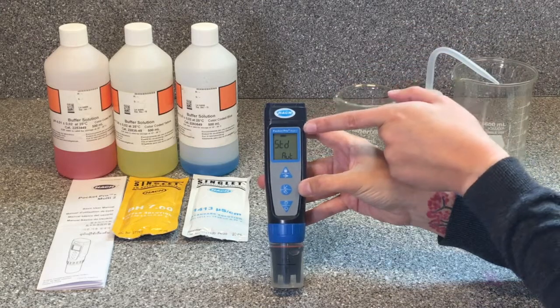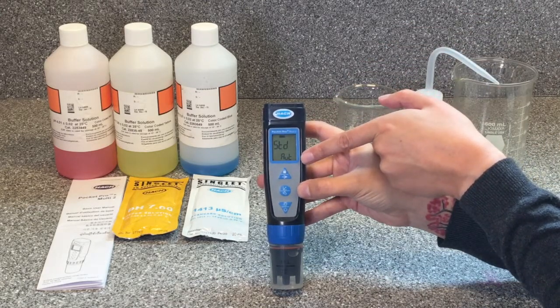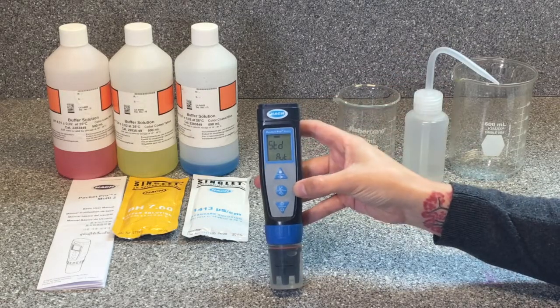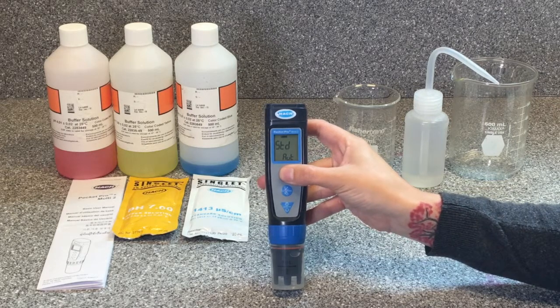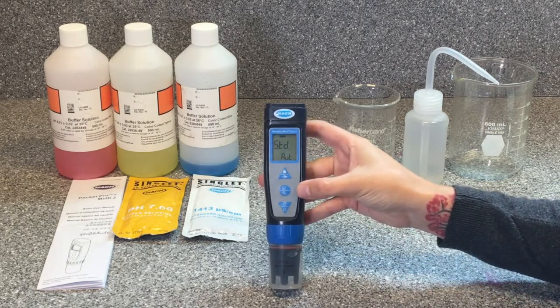The next one should say 'conductivity standard.' We need to make sure it says 'AUT' on the bottom for auto, so it will use the auto recognition standards that come with our Pocket Pros. If it doesn't say auto, push the arrow button until it does. Once it says auto, we can move on to our third and final calibration setting.